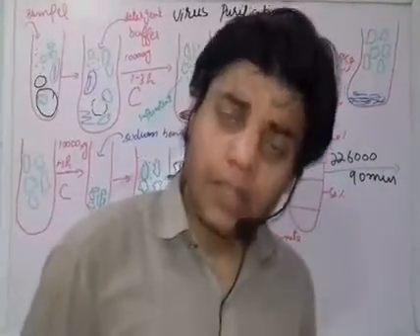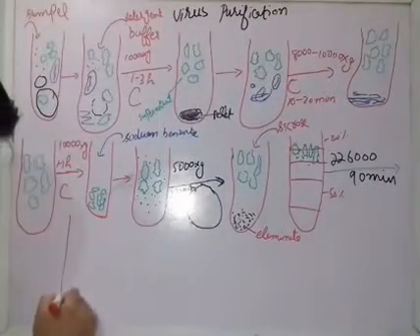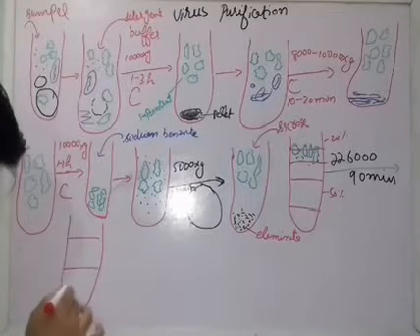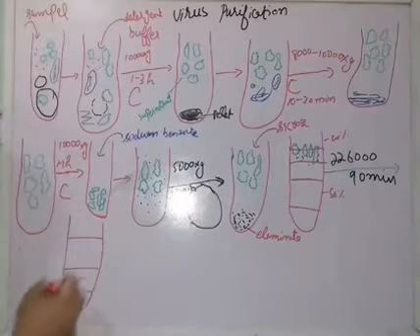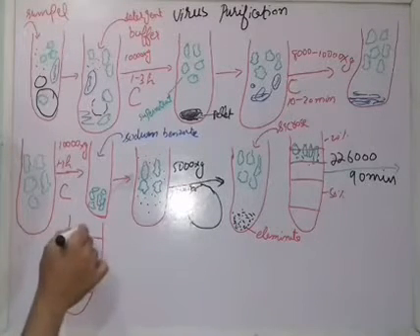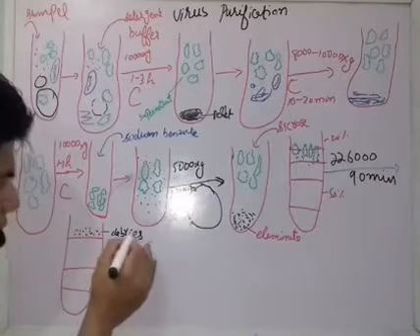After this centrifugation, what we get, although it contains the 3 layers. Now at the first layer, there are the protein debris, protein or some other cell content, or simply we can say debris. Now these are the debris. Fine.